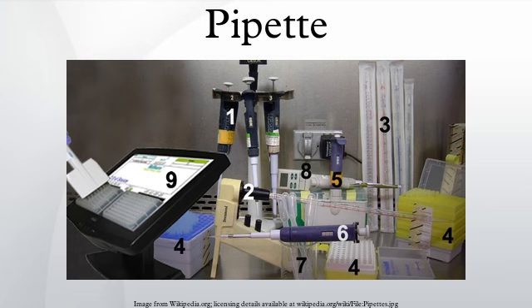A vacuum is generated by the vertical travel of a metal or ceramic piston within an airtight sleeve. As the piston moves upward, driven by the depression of the plunger, a vacuum is created in the space left vacant by the piston. The liquid around the tip moves into this vacuum and can then be transported and released as necessary. These pipettes are capable of being very precise and accurate.